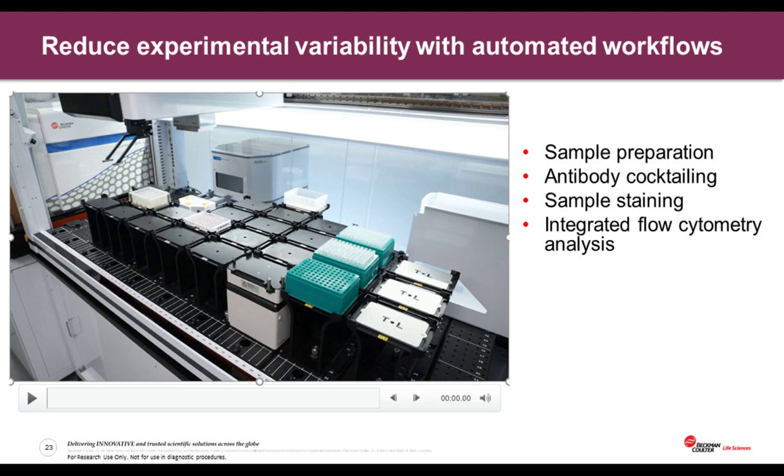What I'm showing you here is a figure of an integrated automation handler with a flow cytometer. This automated workflow is going to prepare the sample for you, cocktail the antibodies, introduce the staining of the antibodies, spin the samples utilizing the centrifuge that's on deck, and then ultimately take the stained sample into the flow cytometer, and if you have integrated it into the LIS system, you can actually export your samples for the analysis.